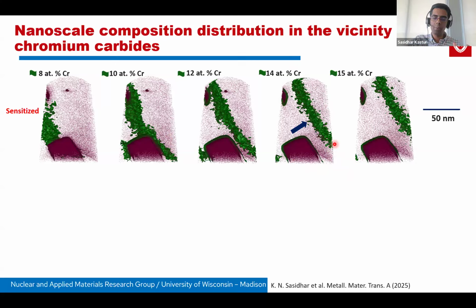You consume the sample, but then you have that data, and you can look at that data in any number of different ways that you want. So like somebody has suggested, they may want to look at the ion density variation. You can use the same data set and look at the ion density variation. So all of that is possible. I hope I answered the question. Yeah, I think that was good.